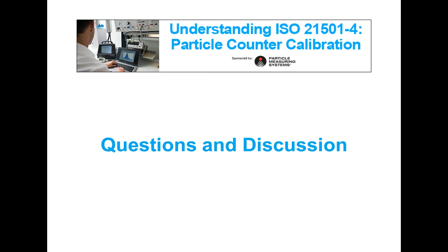And I guess as a follow-up, here's a question. To your knowledge, have the EU GMP guidelines accepted the ISO 21501-4 requirements? Yes, it does, because the EU GMP refers to the ISO 14644 in multiple parts without referring to a specific version of the ISO standard, which means that always the latest one is applied.